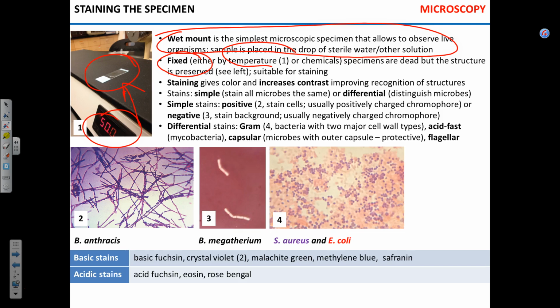If you have a flame going on and you have a slide, so what we're going to do, we're going to use flame. Here's your slide. You go across the flame, like across the very top of the flame. 1, 2, 3.